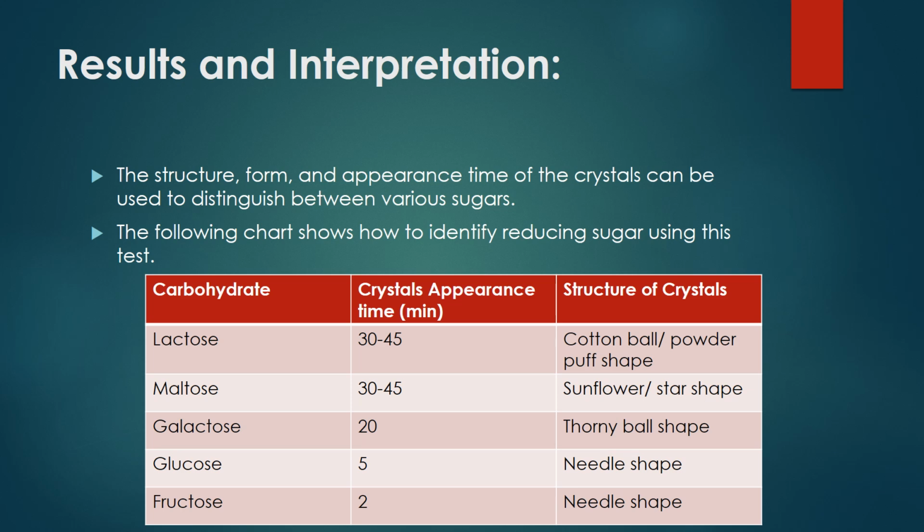Results and interpretation. The structure, the form and appearance time of the crystals can be used to distinguish between various sugars, as I explained this for you.